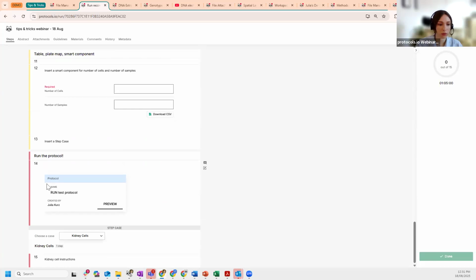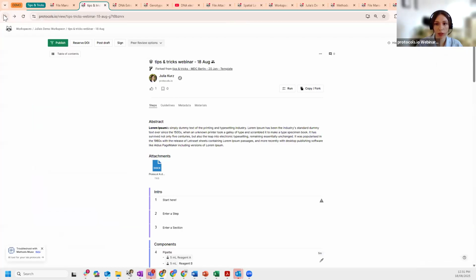that's really weird. This should expand, maybe because I've put in this step case. I've never seen that happen before. I'll actually look into that. But what you'll normally see is, maybe I'll delete that step case and try again.